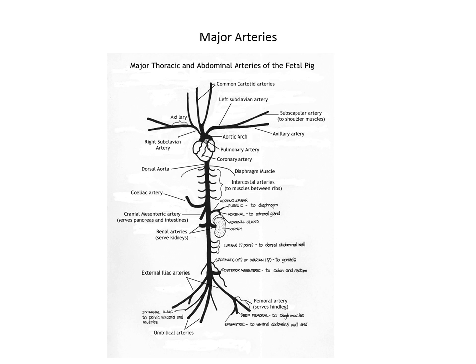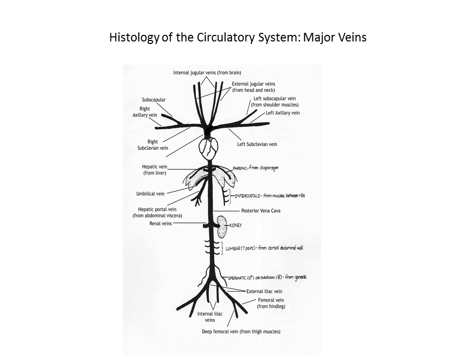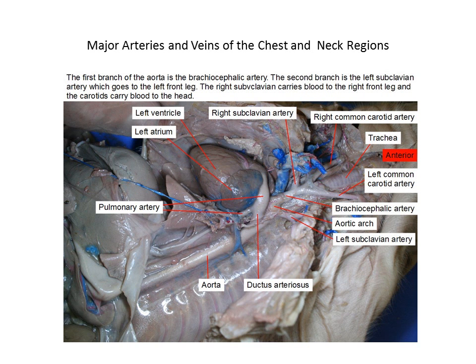We will go through a few pictures of these things. We'll talk about putting some of the names to their functions, but again, that's something you should take care of, ticking off each item as you go through your pig today. What does each of these different arteries and veins service? So again, the different things come in pairs, so if you compare the vein figure with the artery figure, most of them correspond.